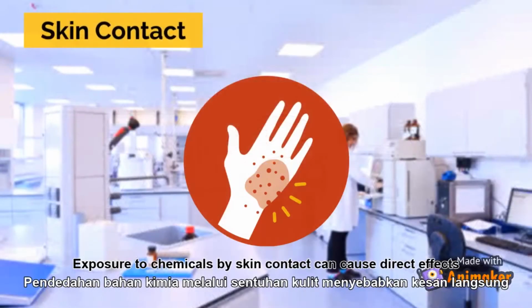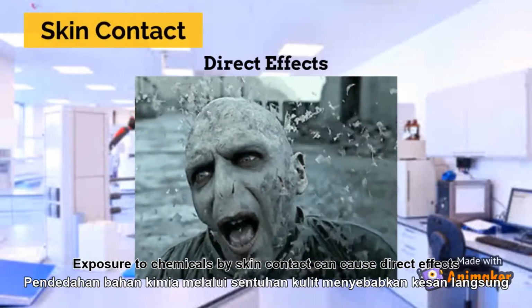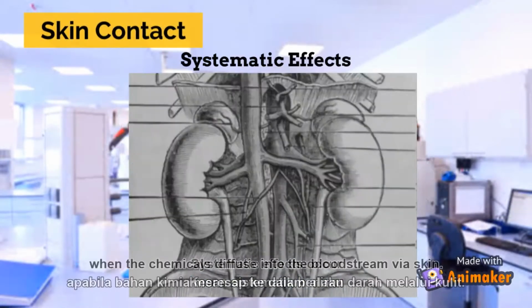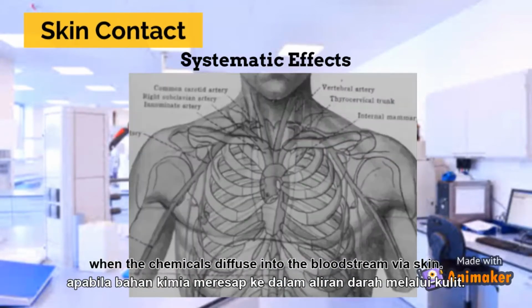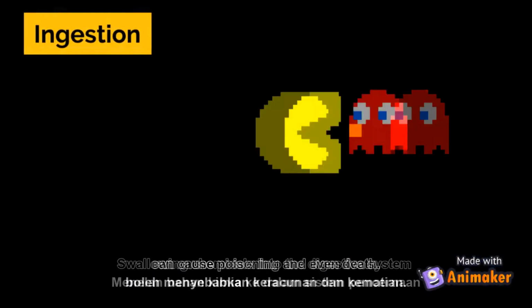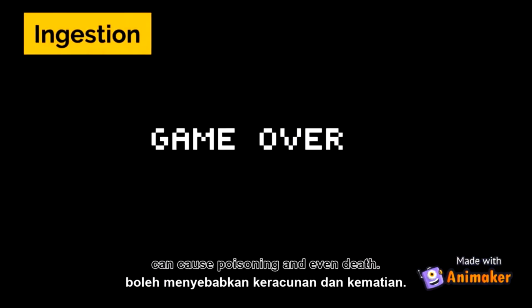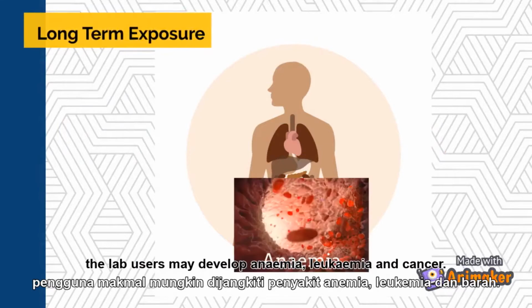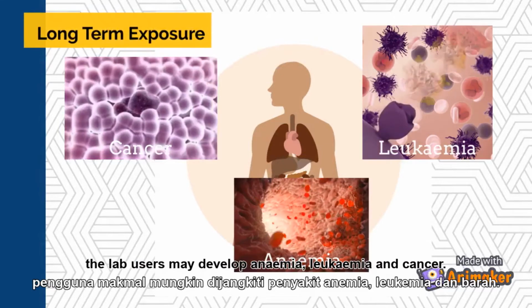Exposure to chemicals by skin contact can cause direct effects such as skin drying and irritation. Systemic effects occur when the chemicals diffuse into the bloodstream via the skin. Swallowing chemicals into the digestive system can cause poisoning and even death. For long-term exposure to chemicals, lab users may develop anemia, leukemia, and cancer.